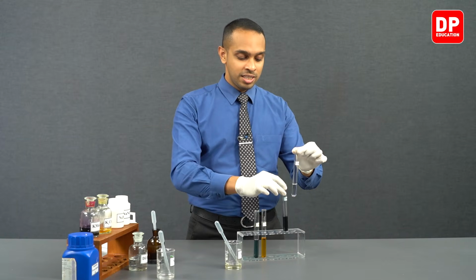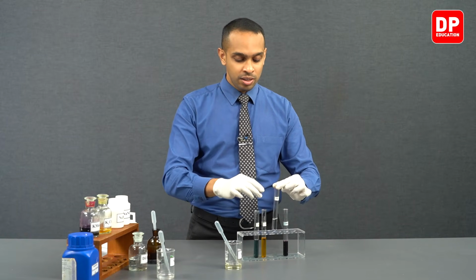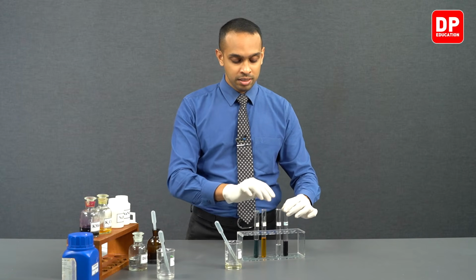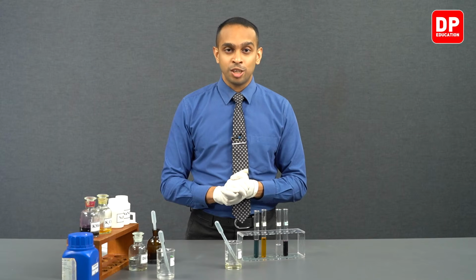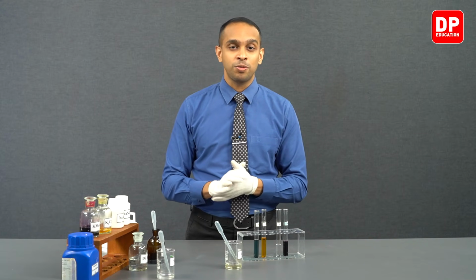So this indicates that when you are reacting nitrite ions, you will see nitrite ions are capable of getting oxidized to form nitrate, and if you are using oxidizing agents such as acidified potassium permanganate or acidified potassium dichromate, they will change their color.